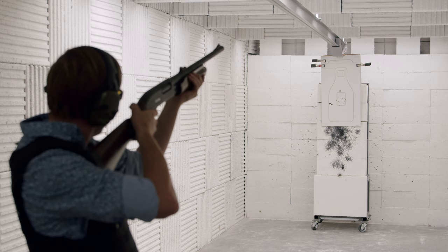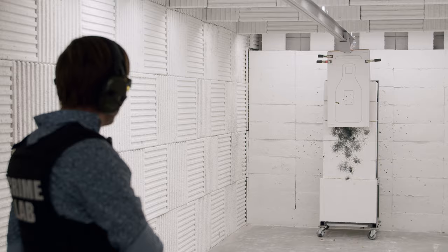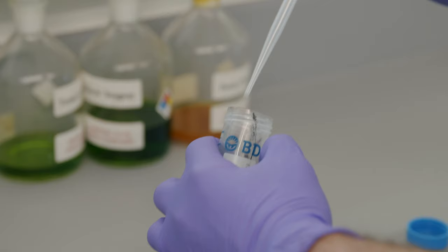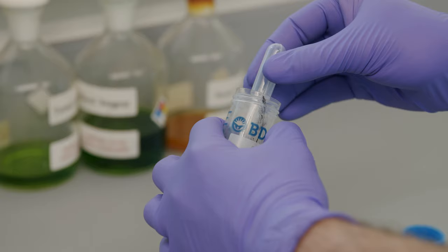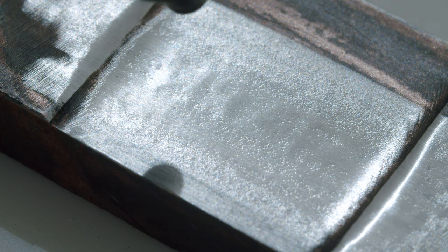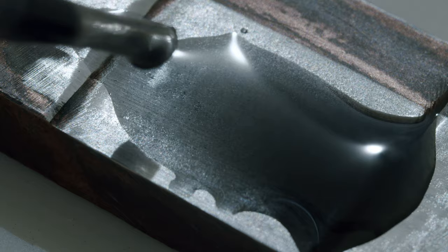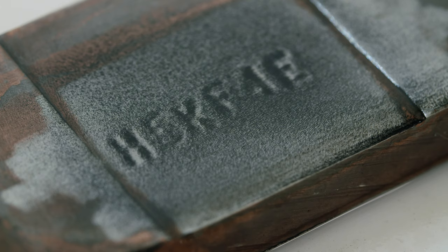One other type of analysis we do here in the laboratory is referred to as serial number restoration. Occasionally, someone will deface or obliterate the serial number on a firearm in order to hide its origin or identity. In those cases, depending on the depth of the obliteration, we can sometimes bring those characters back using a number of different physical restoration and chemical restoration techniques.